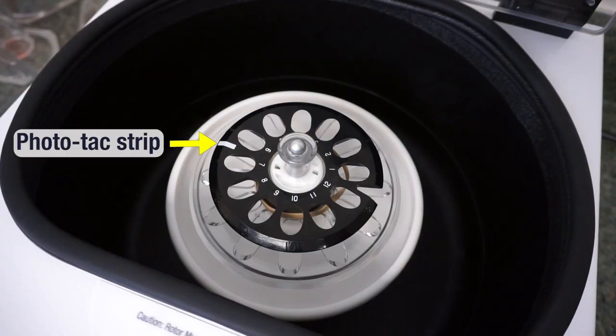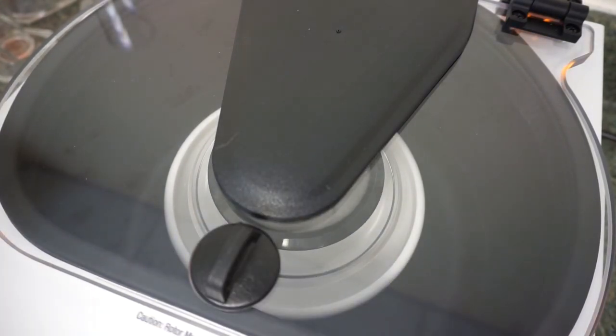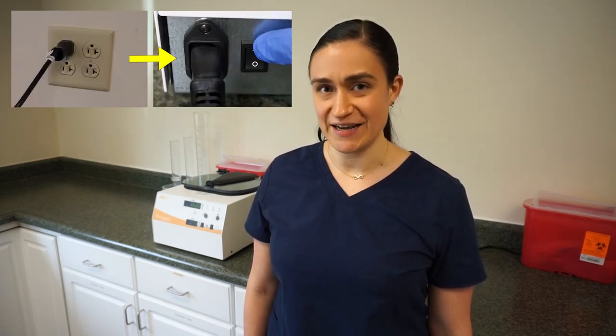That's all there is to cleaning your SARA-12. Your SARA-12 is designed to require no regular maintenance — all internal parts are self-maintaining. If you wish to calibrate the centrifuge, the rotor has an easy-read photo tach strip on it. Close the lid, run a cycle, and point your photo tachometer device down through the clear lid to easily get a reading and calibrate accordingly. Once you're done with cleaning or maintenance, always make sure your SARA-12 is plugged in and turned on again so it's ready to spin your next cycle.